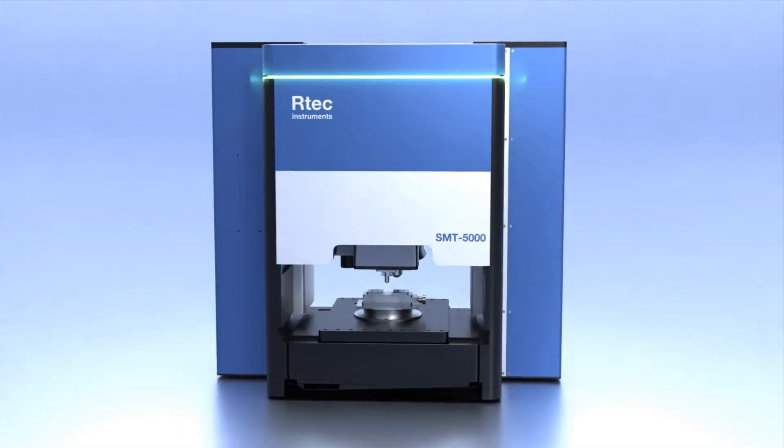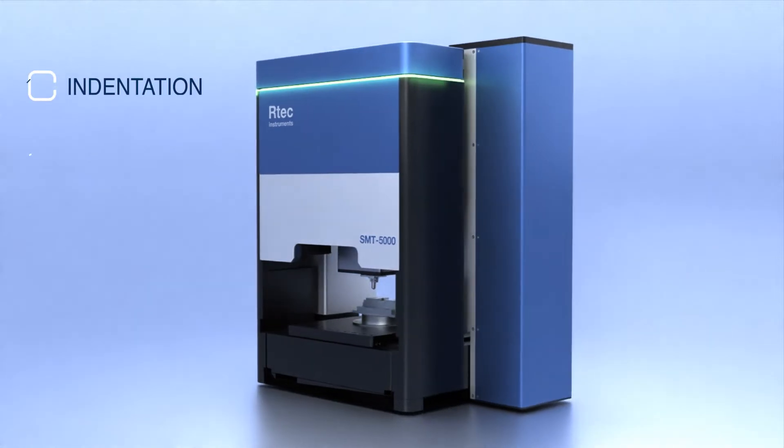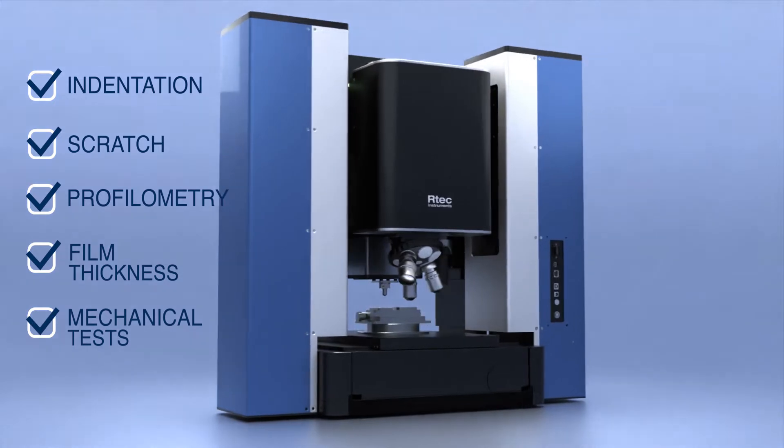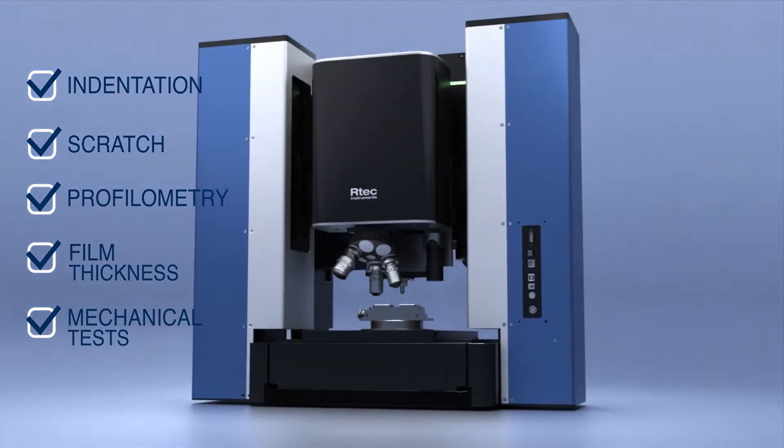The reimagined modular design provides indentation, scratch, profilometry, film thickness, and mechanical tests on the same platform.